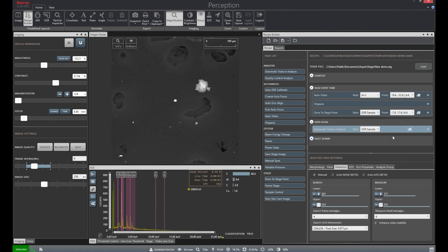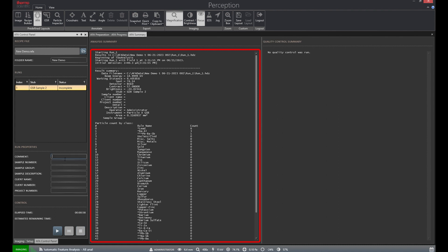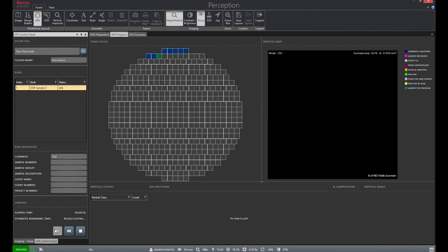Once our recipe is set, we can now move to automatic feature analysis, or AFA. The AFA tab is where runs will be executed and where reporting for the run can be viewed. We start by loading up our recipe file and then filling out information about each stub that is to be analyzed and the run below. After that information is inputted, we can hit play and the analysis will begin.